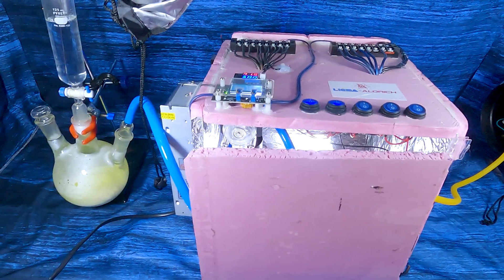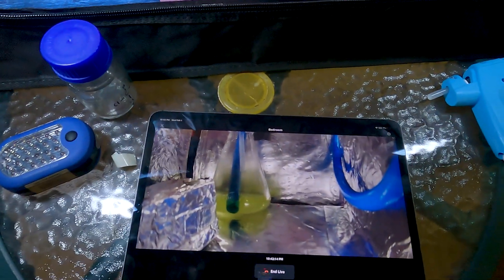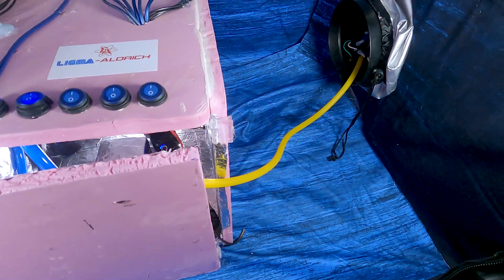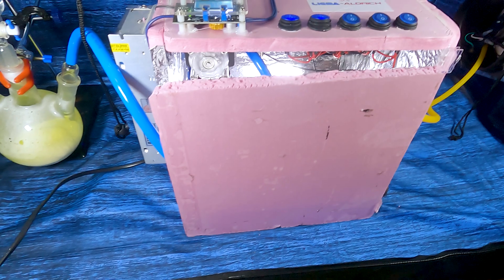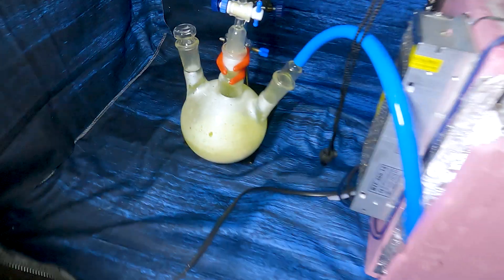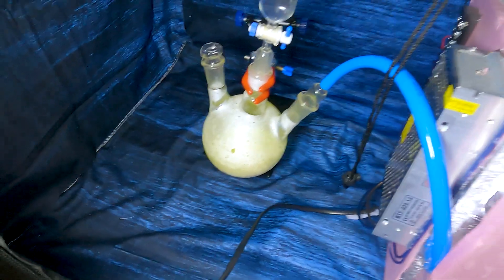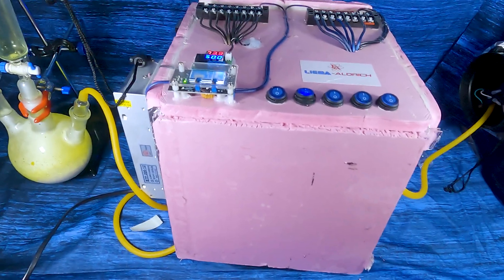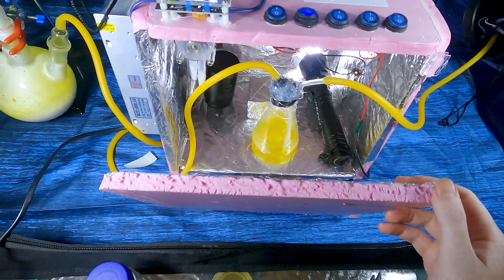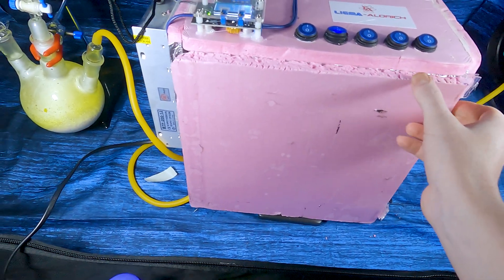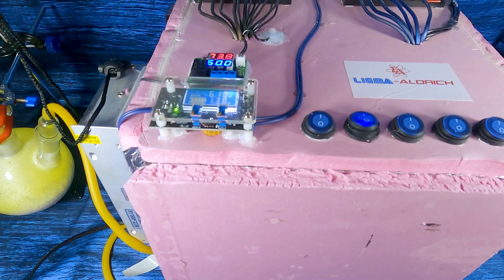Okay, we are running — the door is closed as much as possible, and there's a live feed down here to let me know what's going on. Everything is good; had to get rid of the scrubber and go directly to the fan — that's alright. The gas looks a little bit wet; I'm a little concerned about that, but we'll see how she goes. We are currently at a beautiful, gorgeous yellow color in there. Running this with my 310 nm LEDs this whole time.